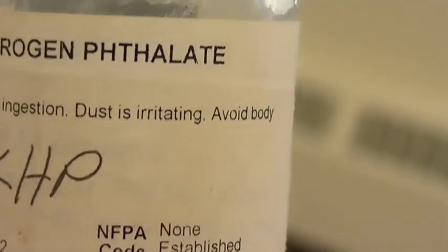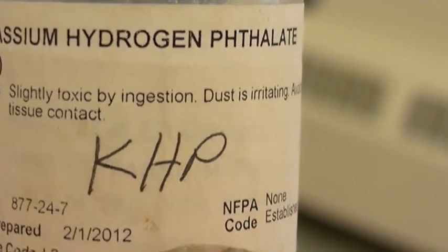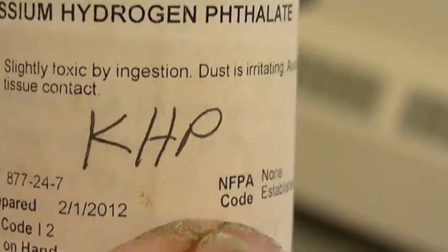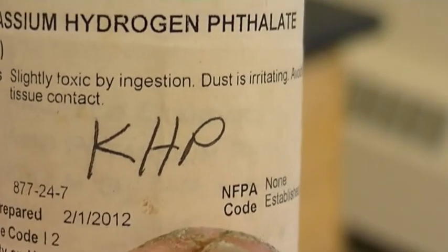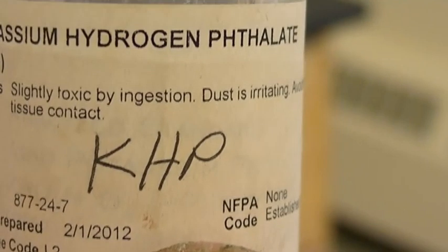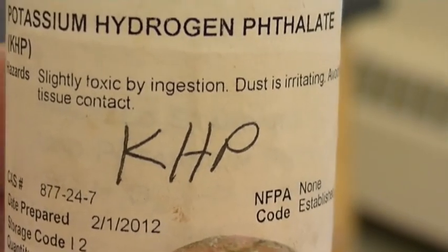All right. And it has 1 H, KHP. And so this is our acid. It is a monoprotic acid, a 1 hydrogen acid. Again, important to know when we do our balanced chemical reaction. All right, and so I'm going to weigh this out for you, and we will then do our titration with a solid. This is a solid that I'm going to weigh out. I'm going to dissolve it in deionized water, and then we're going to titrate it. So I will get that prepared for you, and we will run this titration.